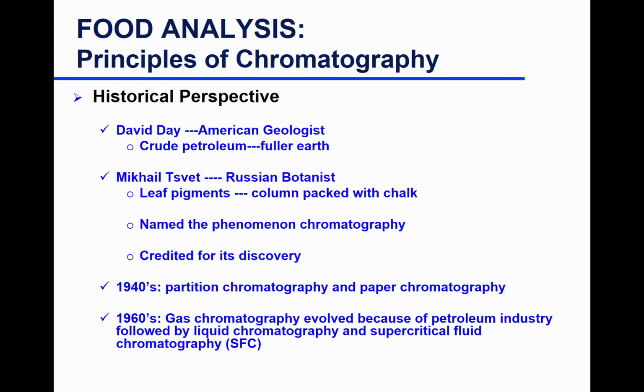And that's why he gave it the name chromatography, from chromophore, or compounds that have color. But nowadays, of course, we don't only separate those that are chromophores. We separate all types of compounds. But still, the name came as chromatography because of that discovery. He got the credit for its discovery because he characterized the process much more clearly than David Day. And then in the 40s, chromatography that was used mostly is partition chromatography and paper chromatography.